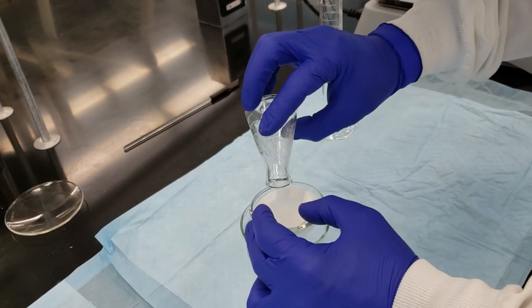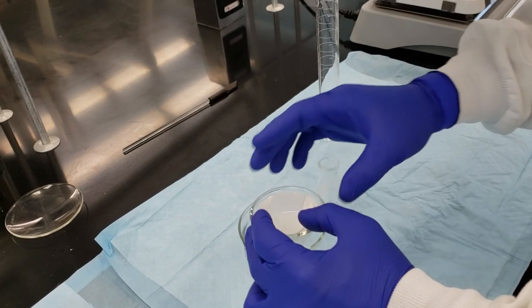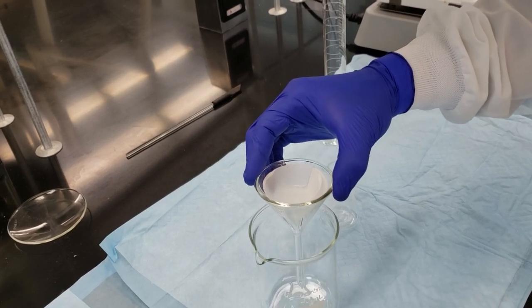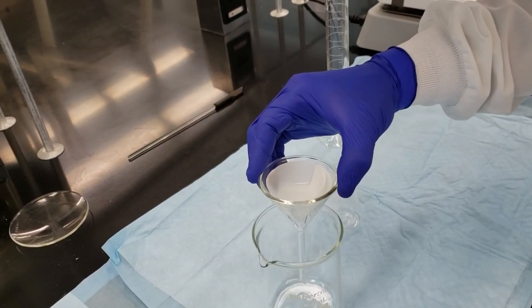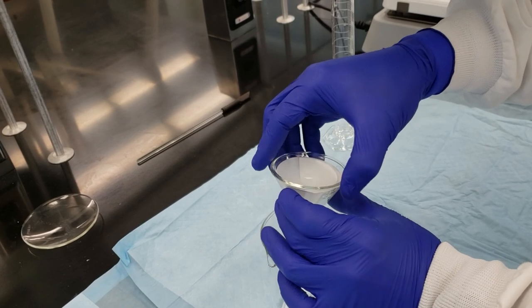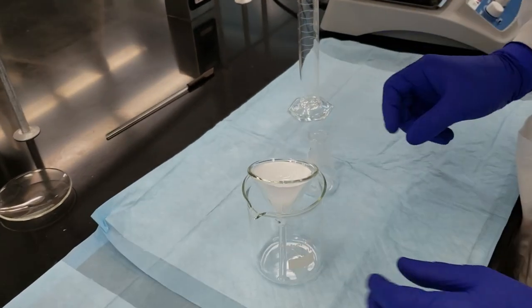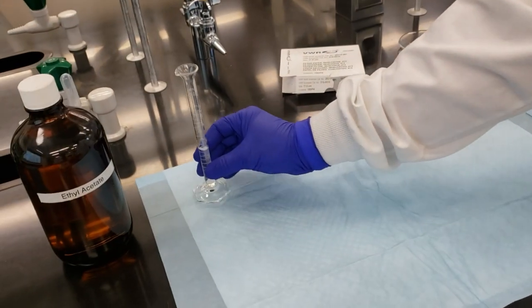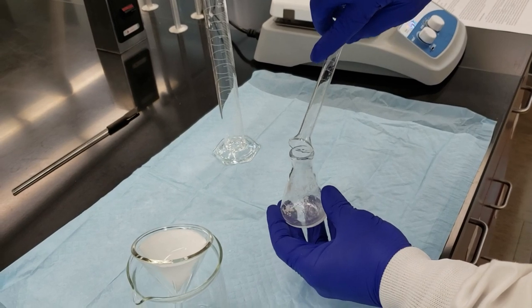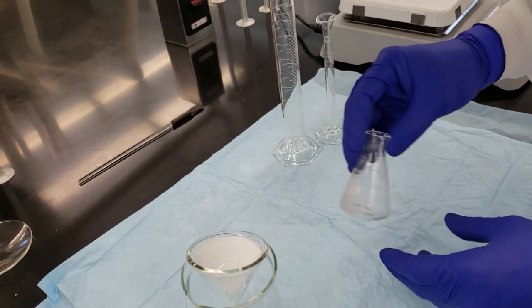So what we want is our amide product to dissolve into our ethyl acetate, to flow through our filter paper and into our beaker, and we want to capture all of our solid catalyst, our aluminum oxide, in our gravity filtration. I'm going to set this on its side briefly and let it continue to flow. In the meantime, I'm going to take another 5 mils of our ethyl acetate, second wash, and pour that into our reaction flask. This is just making sure that we get all of our product out of our flask.